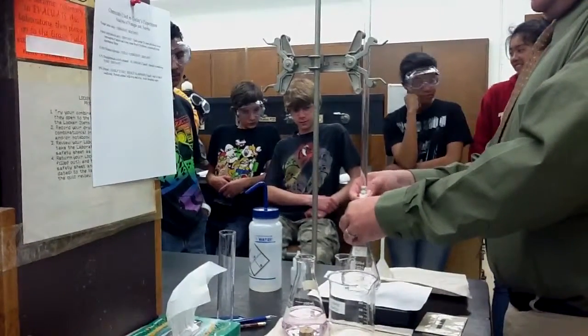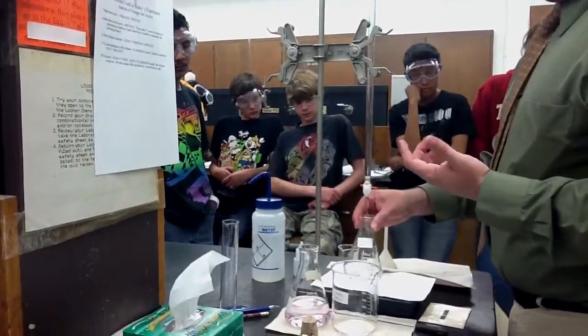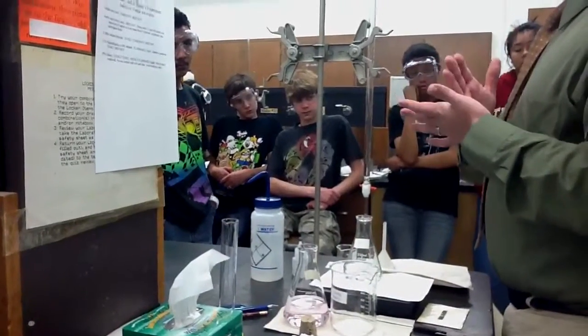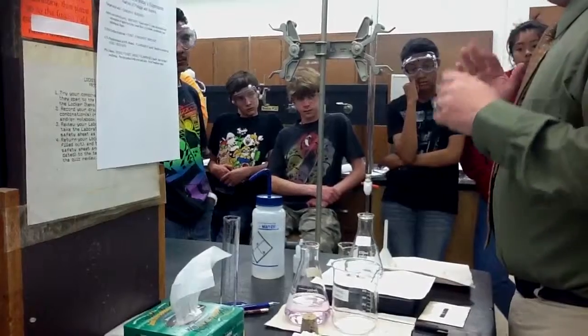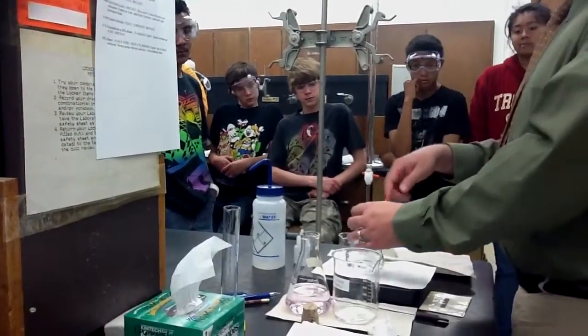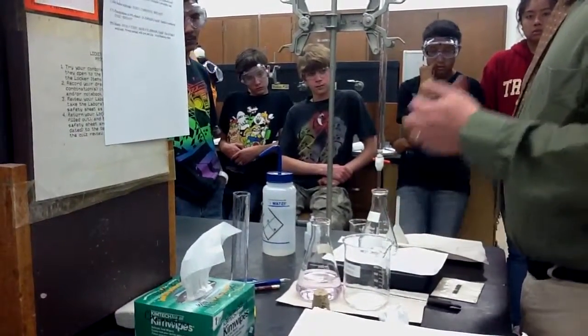And afterwards, as you get good at this, maybe you need a few drops, or maybe half a drop, or a quarter of a drop, okay? Because you're almost there. If you add one whole drop, it turns dark pink. A quarter of a drop is basically having the drop come out and letting it touch the tip at the glass and then run down.